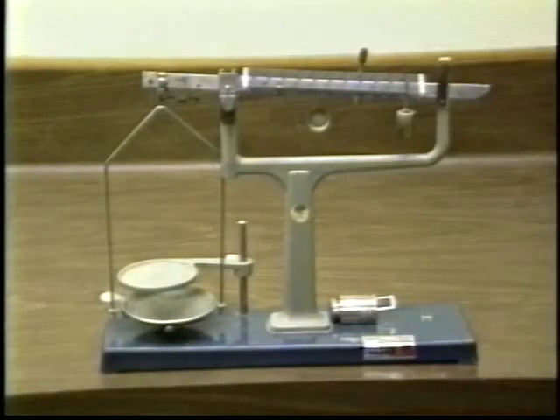The triple beam balance is so named because of its three beams with sliding masses. It is a common type of balance and comes in many styles.